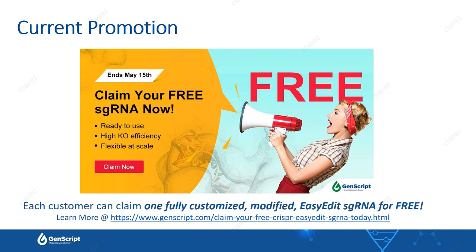Another question. If you have a CRISPR target which is equal to a possible off-target in the cell genome with a difference of just the PAM sequence, will that be edited too? So if there's the one without, hold on, give me 1 second to think about this. The one without the PAM sequence should not be edited. The PAM sequence is critical to the editing event, so you should be safe. In fact, if you are doing a knock-in workflow, we advise you, if at all possible, to silently change your PAM sequence. So the one without PAM should be safe.